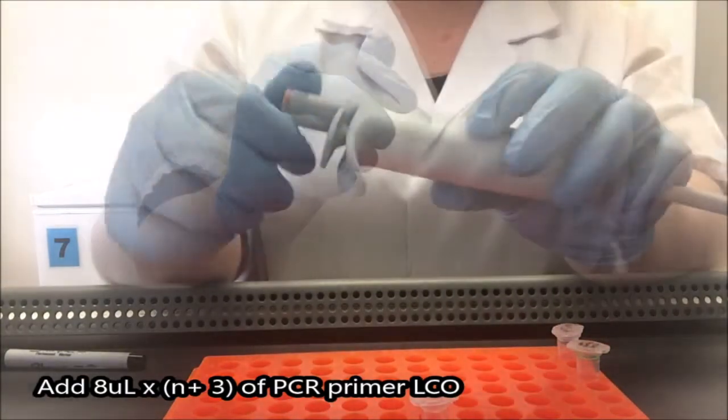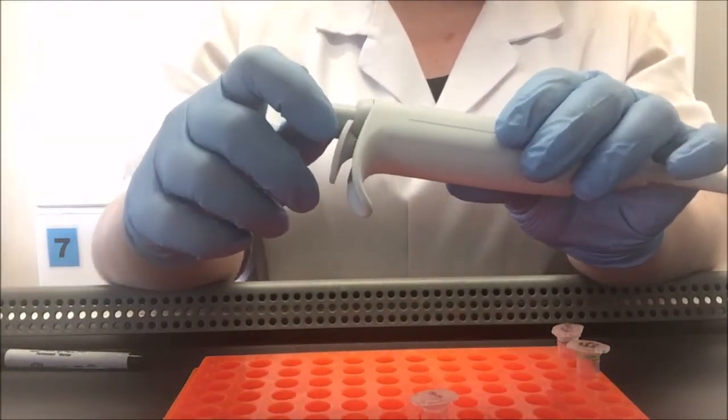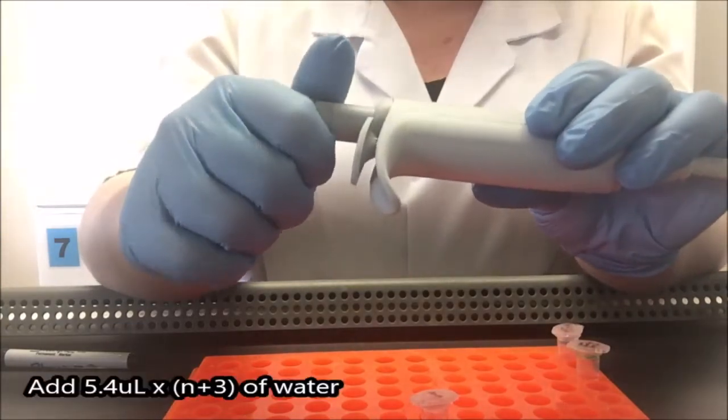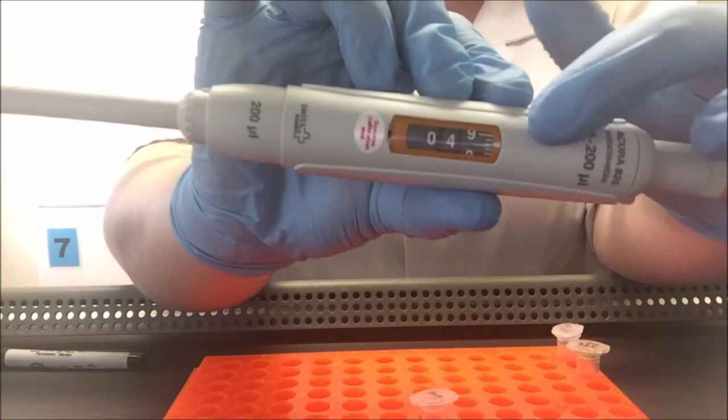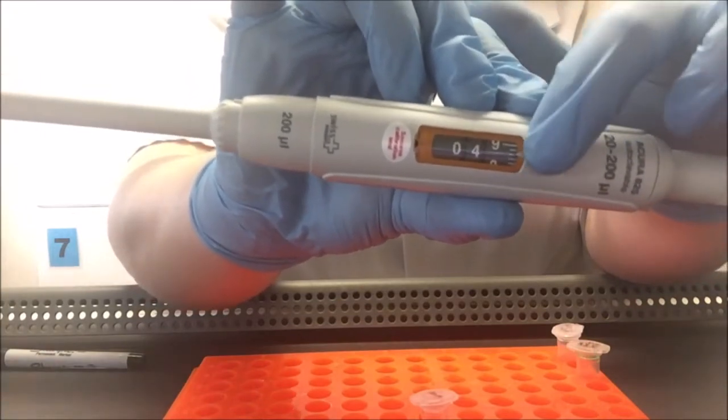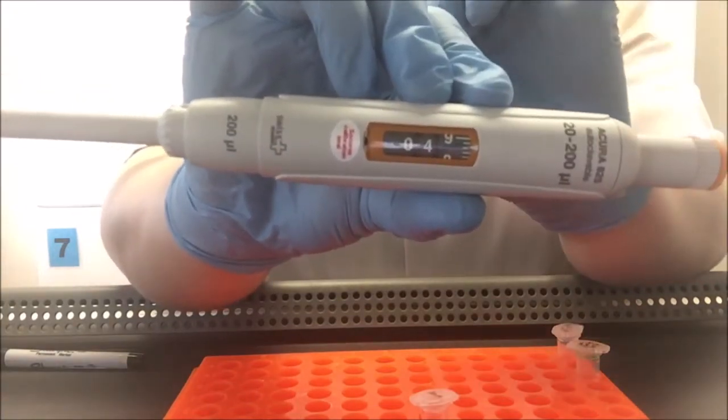Next, I'm going to add my water, 48.6 microliters of water. So that's 5.4 microliters per sample. So here, to get the decimal, I've had to use the little lines that you see here. It works much the same way as a ruler.